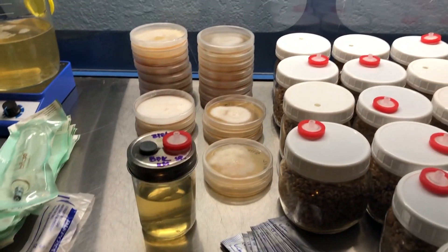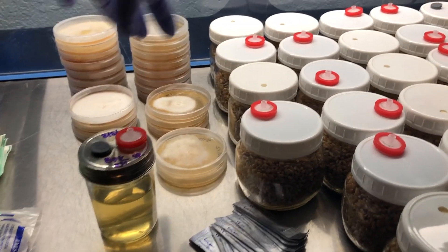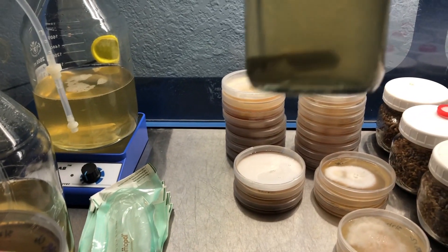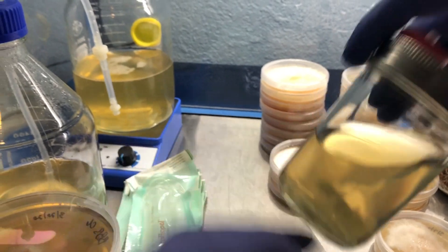I've got my workstation all set up. I'm going to be using fresh plates for every single different strain. I'm going to start with my liquid culture black pearl king oyster — you can see the mycelium right there. I'm going to shake it up a little bit on the stir plate just to get that going.